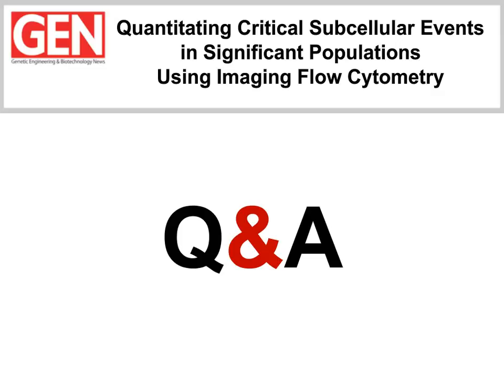Essentially, with the extended depth of field on in the imaging flow cytometer scenario, you're doing a sort of mathematical deconvolution to pull all of the images within the depth of the cell onto one focal plane. But no, we weren't able to do that with the in situ approaches, but that would be an interesting analysis to do and to compare with the extended depth of field on the imaging flow cytometer at 60x. Having said that, we think that we've got pretty good resolution of foci using the imaging flow cytometer at 60x with EDF. We're really quite pleased with that.